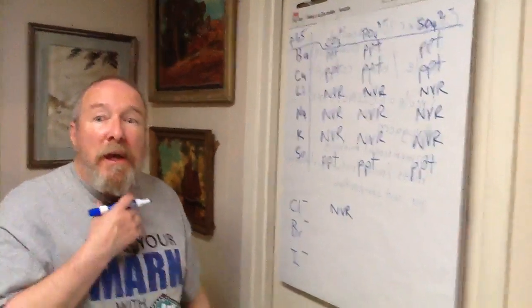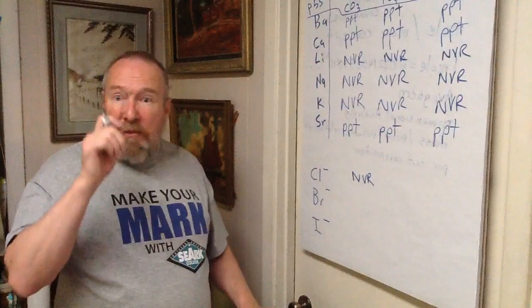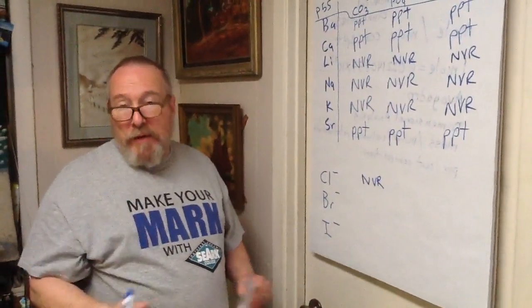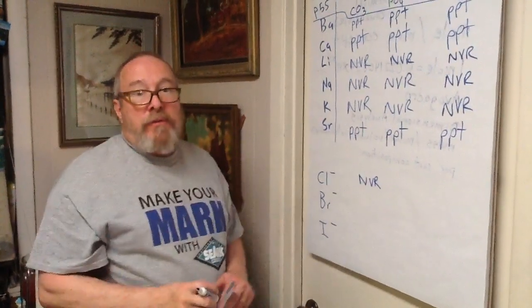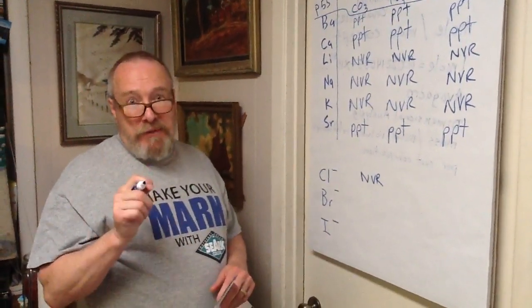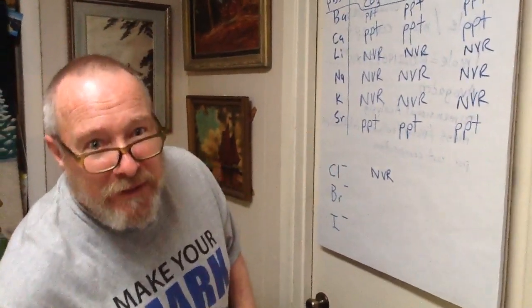Then we did a halogen test where we reacted it with nitric acid, sodium hypochlorite, also known as bleach, and extracted. I have allergies, that is not COVID-19. And you know me, I need to be drinking whenever I'm lecturing.